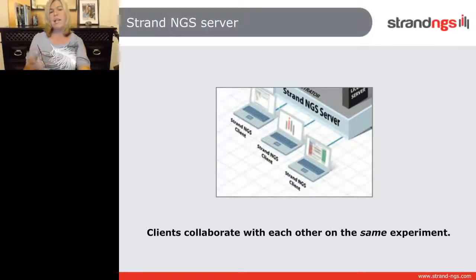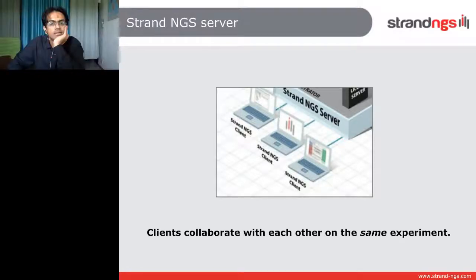Does Strand NGS Server support only DNA sequence, or are there other options or other workflows? Great question.